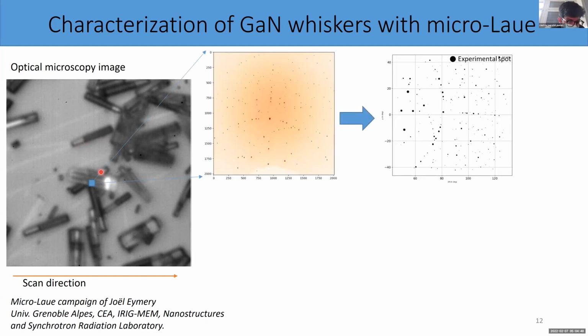And how does the Laue pattern look like? If I take a single measurement of one of these spots that we have done, basically when we do Laue diffraction, we do a raster scan. Just like EBSD, we do line scans. We go from left to right, and then we try to complete the area that we want to analyze with the beam size and a given step interval. So for one of the measurement points, you can see that the Laue pattern looks like this.